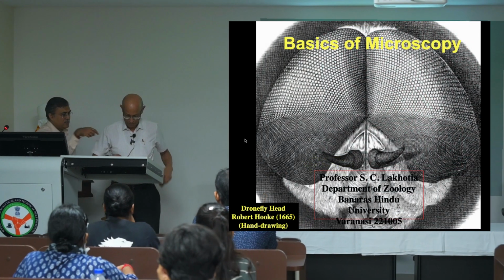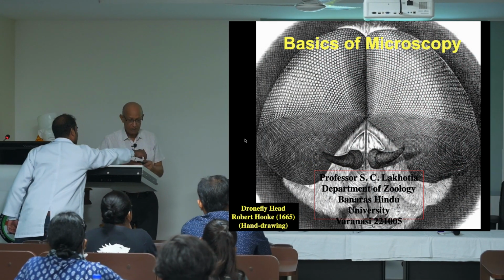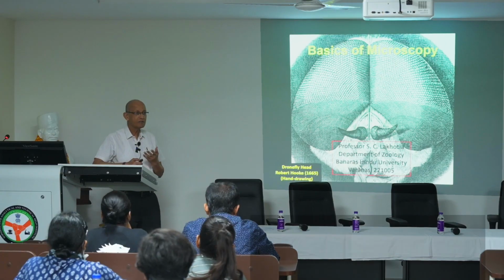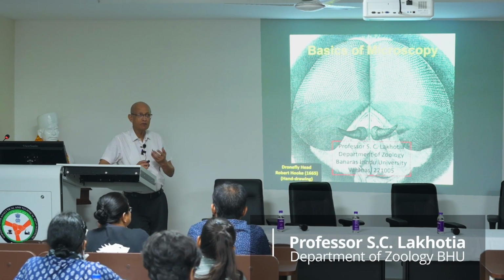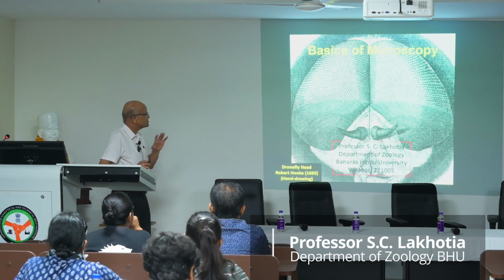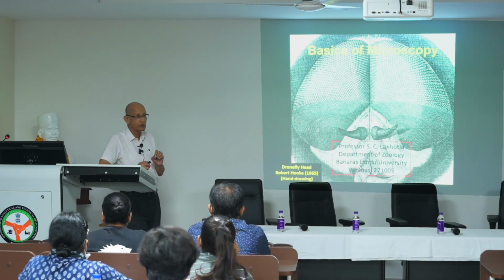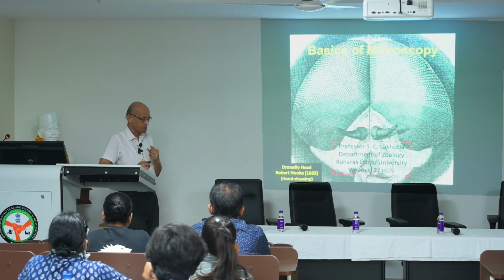All right, I'm happy to be talking about microscopy. I believe that some of you might have heard it, so it may be rehearsing the same thing all over, but still something may be learned, something may be better understood. What I'm going to talk about is just the basics, not the confocal aspect, except that I will introduce why confocal and how it differs from a regular microscope.